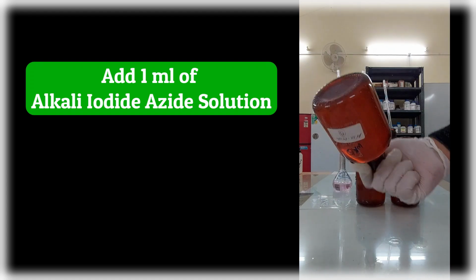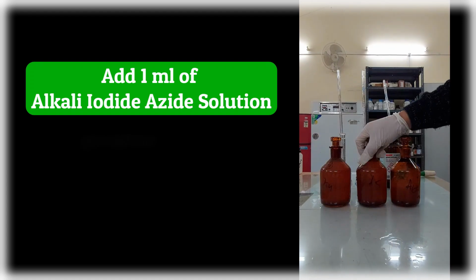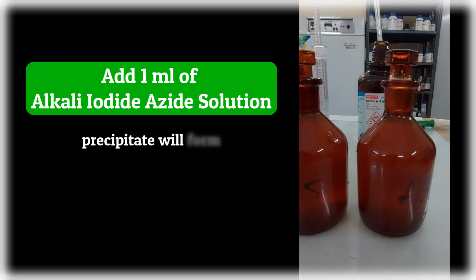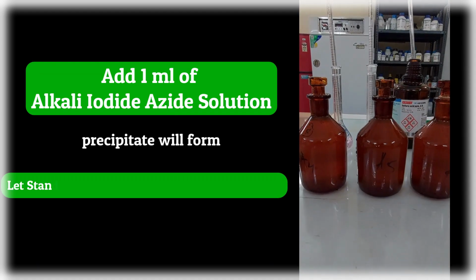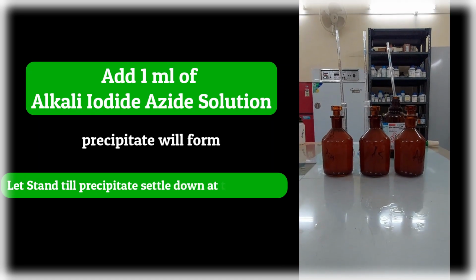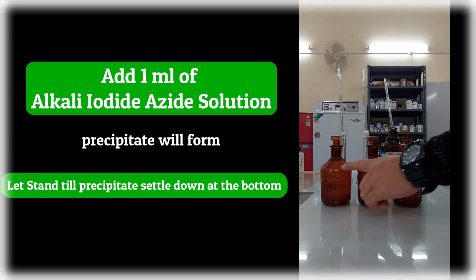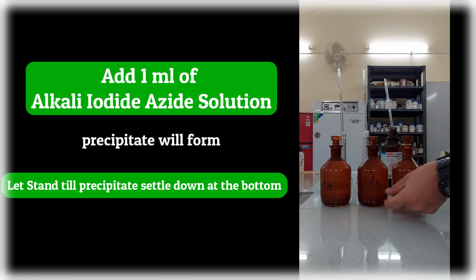And after addition of this solution, precipitate is being formed. Then you can let the solution stand till the precipitate settles at the bottom of the bottle.